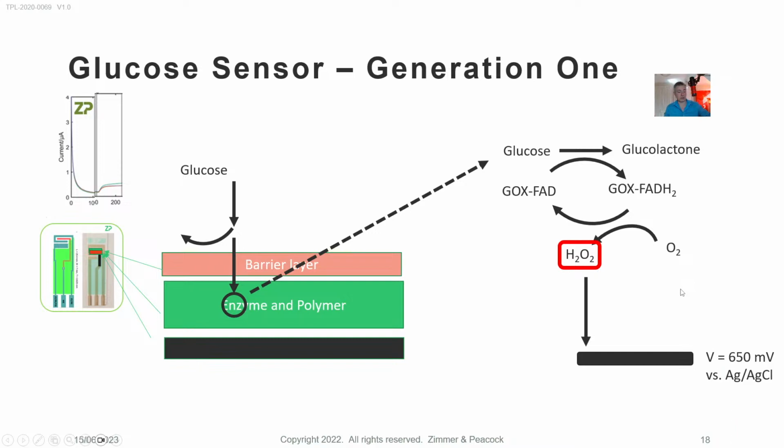Now, 650 millivolts seems a bit arbitrary. And again, it really is covered in our workshops, and everyone gets to test one of these sensors, and they actually get to test lactate sensors, and they also get to build glucose and test glucose sensors in the workshop, just to contrast it with a generation 2 sensor. So it's going to be a very similar story.